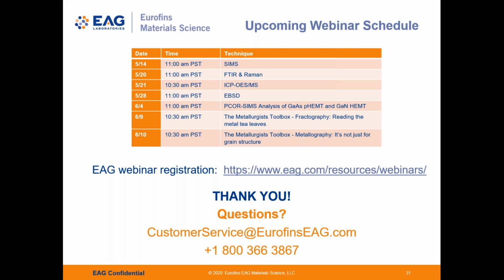NRA is used mainly to extend the detection limits of lighter elements for a certain concentration range present in the film, usually on the order of 2 or 3 atomic percent to less than 10 atomic percent. The elements I'm talking about are boron and lithium. Those are the two main ones, and to a lesser extent, carbon, nitrogen, and oxygen.